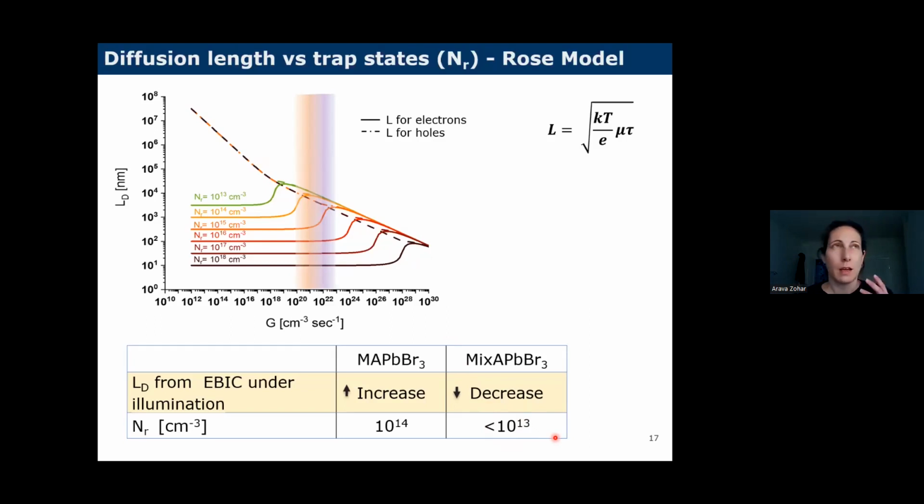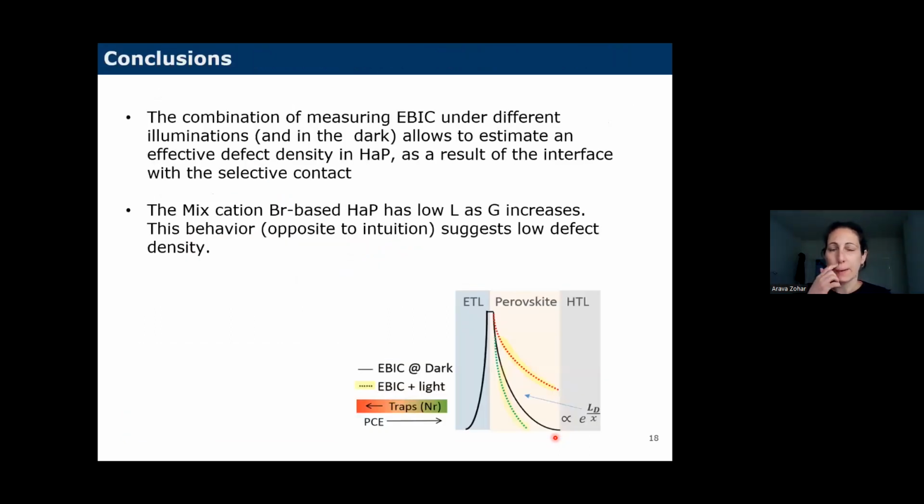And if you can think about any other techniques that can assess, I think 10 to the 5 less than what you have in the valence band, less carriers, it's very difficult. Usually the sensitivity of the UPS and many other techniques is like 3 orders of magnitude below the population. And this is very nice, to get some data out of it.